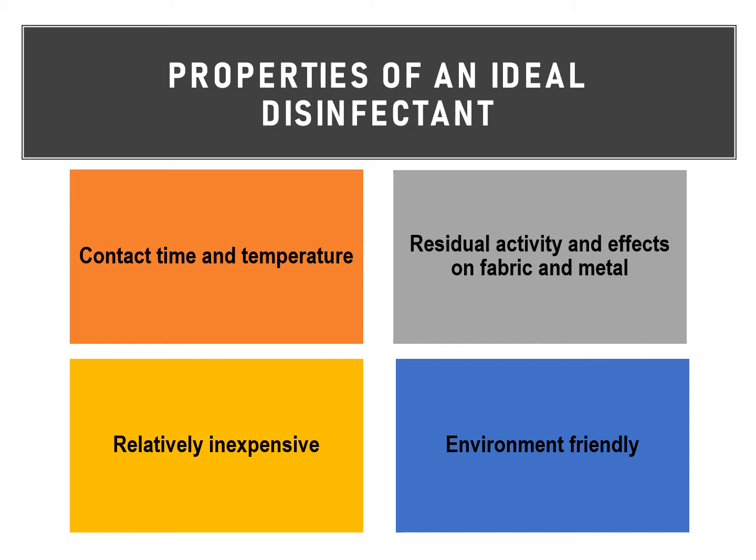Third is that our disinfectant must be relatively inexpensive, or it must be economical. It should not be prohibitively high in cost. And lastly, our disinfectant must be environment friendly. It should not damage the environment on disposal.